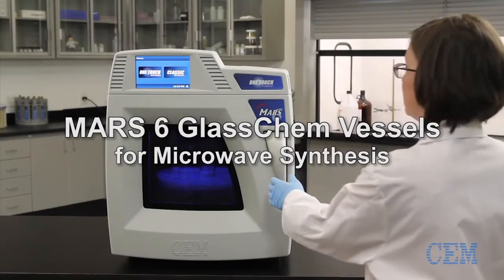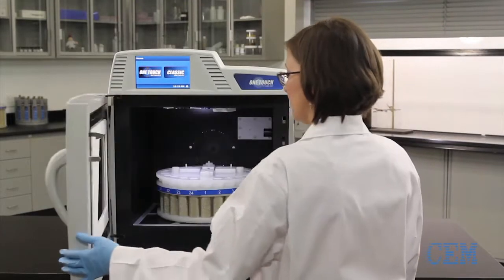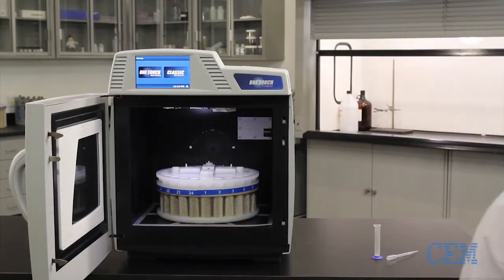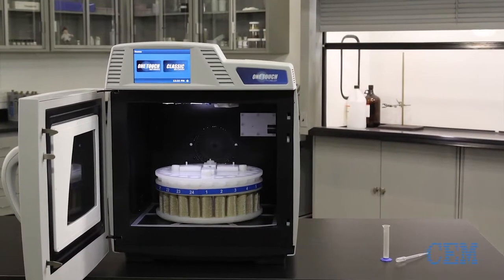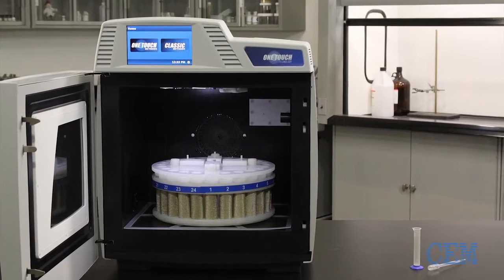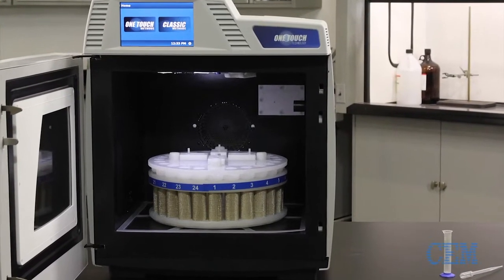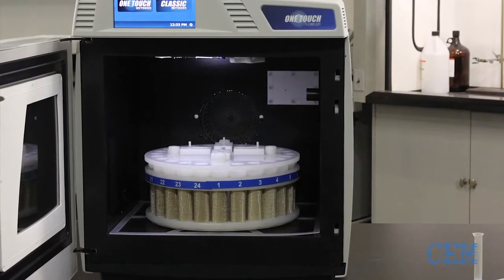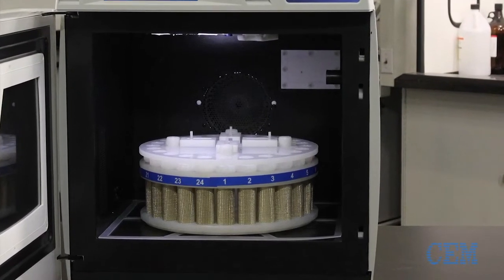Glasschem vessels are pressure vessels engineered with a simple screw cap for ease of use while providing a wide range of temperature and pressure capabilities. This simple to use vessel permits reaction conditions of up to 180 degrees C and 200 PSI.